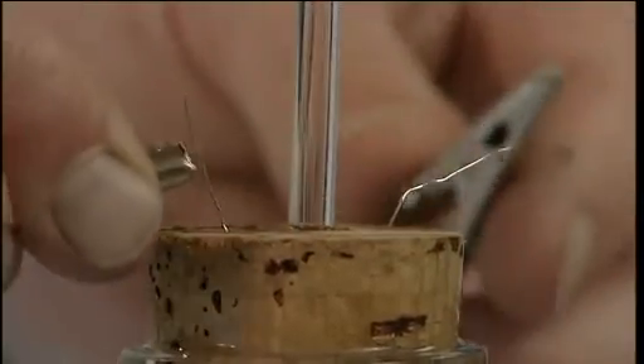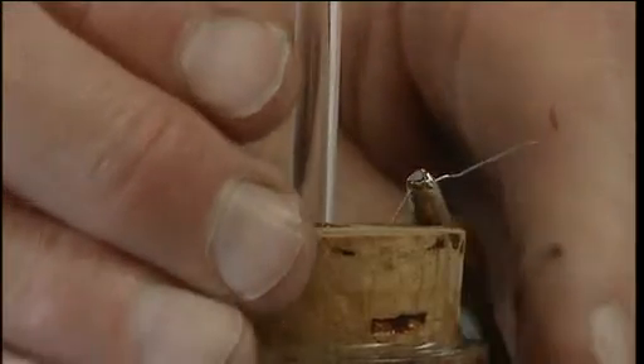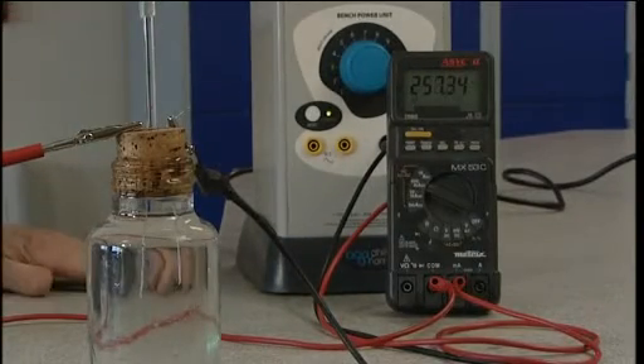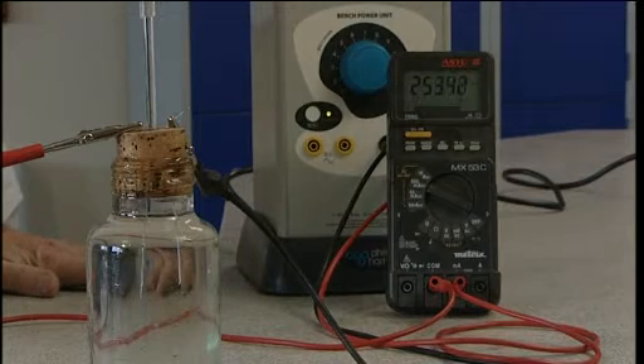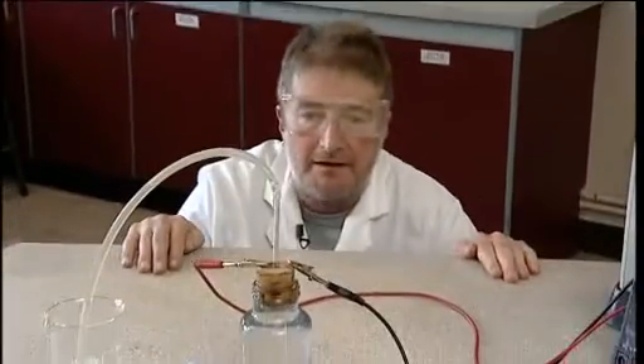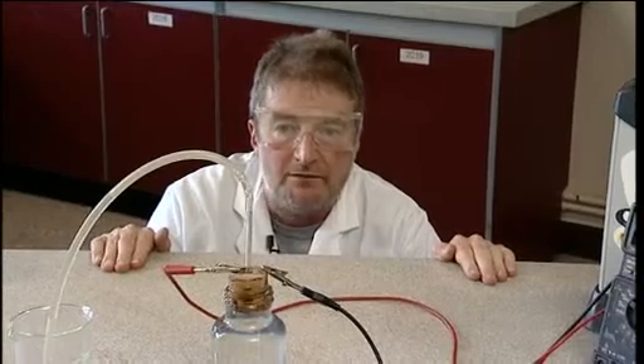We now connect the electrodes to a power pack set at approximately 12 volts with an ammeter in series. The current here is around 250 milliamps, but it can be anything up to about one amp, and we can begin to see electrolysis taking place at the two electrodes. If you look closely, you'll see that there are significantly more bubbles at the negative electrode where hydrogen is being discharged than the positive electrode where the oxygen is being produced.